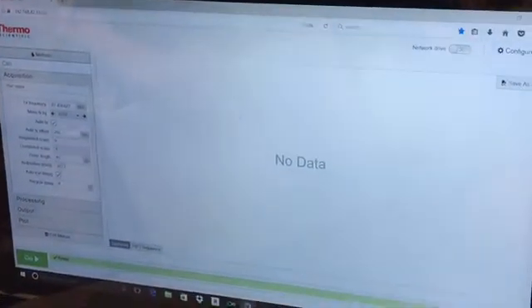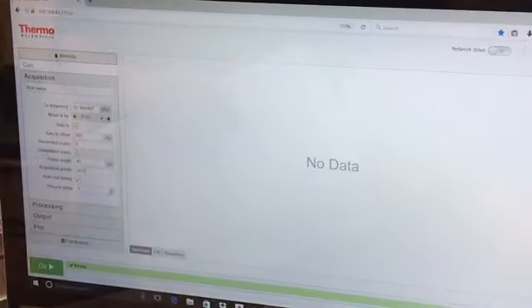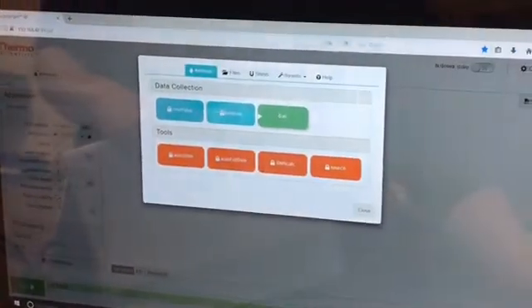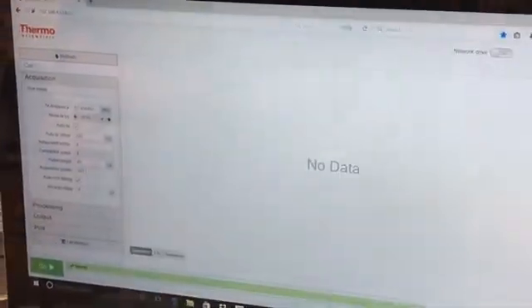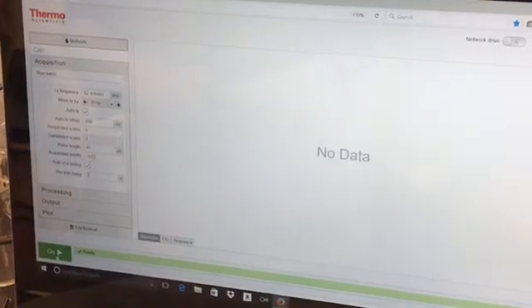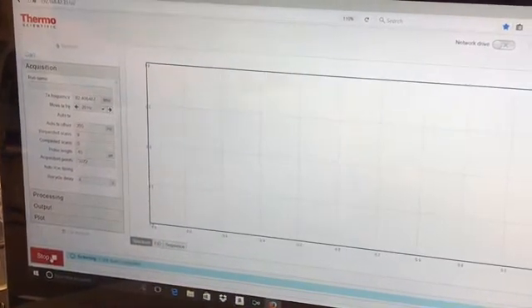Okay, now that you can move over to the computer, you can choose Methods, choose Carry, and then at the bottom left in green, just choose Go, and then it's going to start scanning.